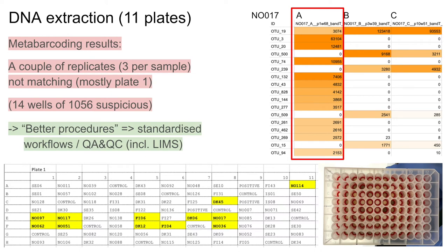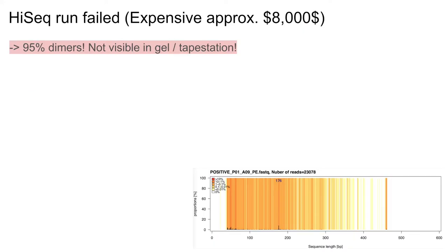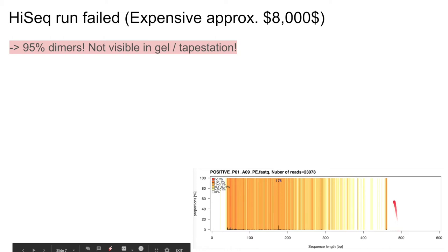From here on out, the lab work was completed without any further issues and we were excited to get some sequencing data back. However, the worst possible thing happened — the sequencing run completely failed. We had an issue with dimers, so 95% of the reads were dimers, which you can see in the histogram. The length of the DNA fragments is very, very short, and we usually would expect over 90% of sequences to be in the expected range. That's $8,000 down the drain.